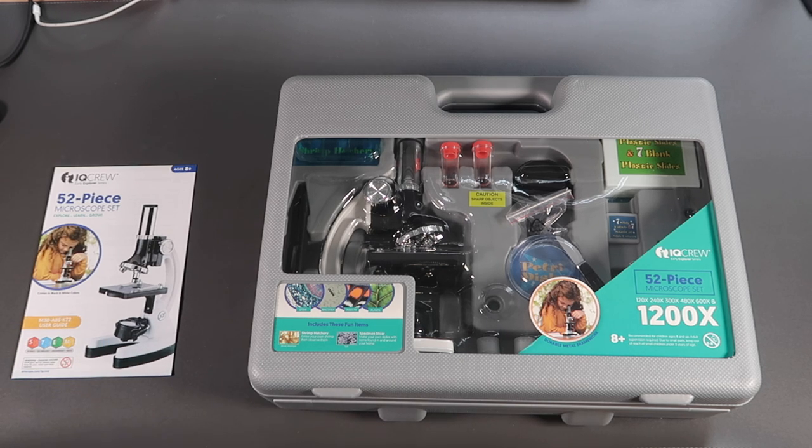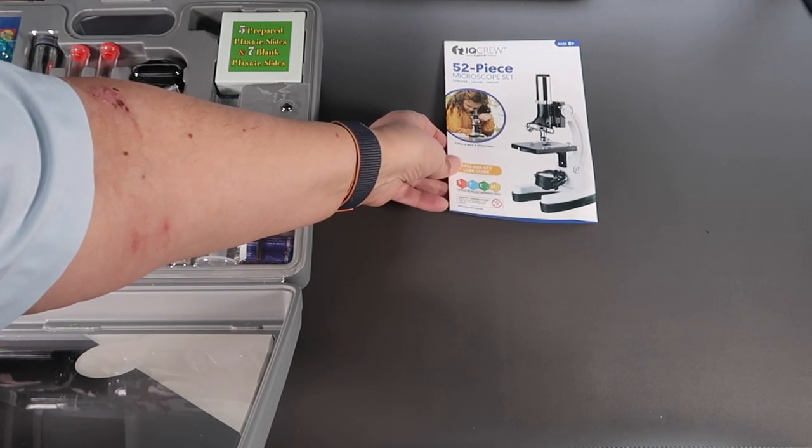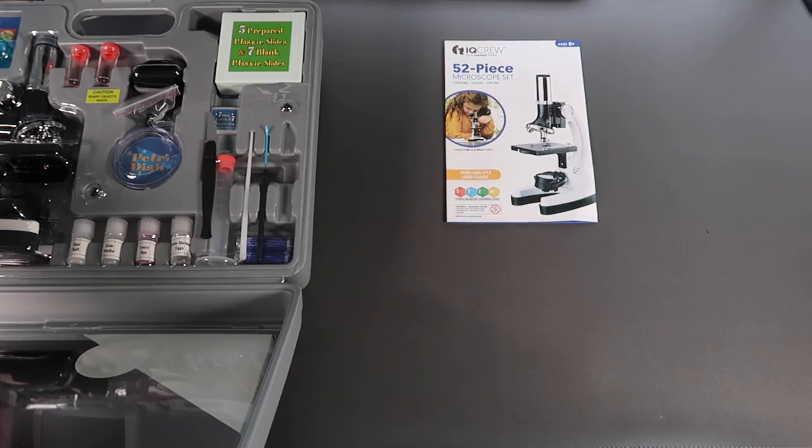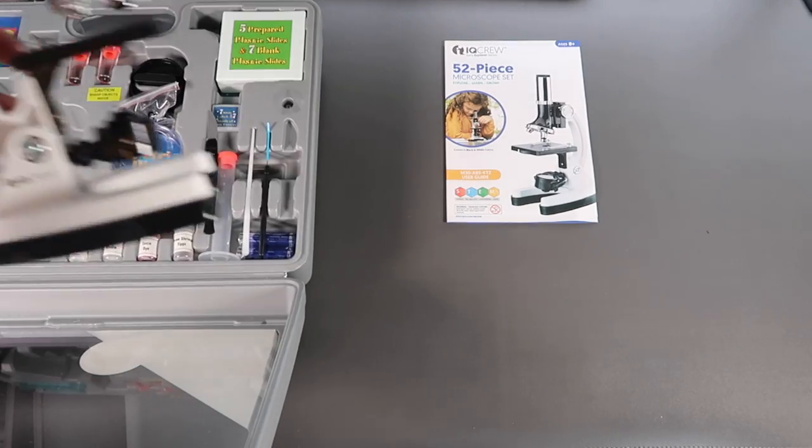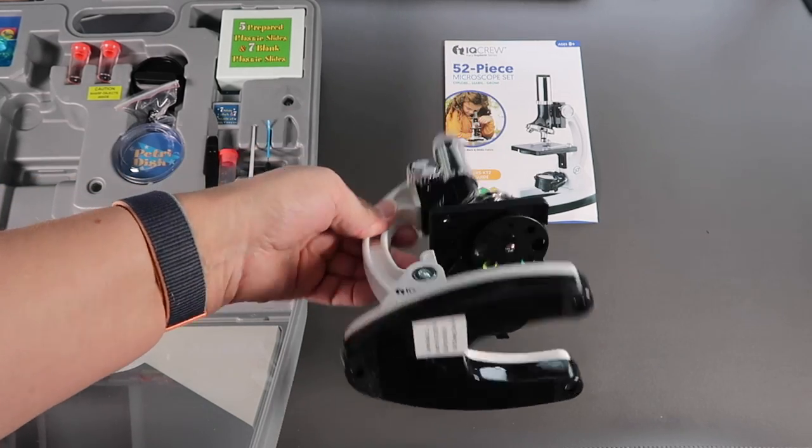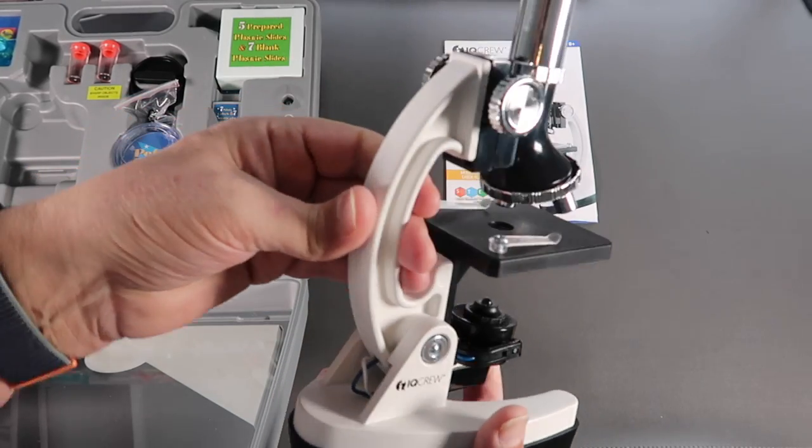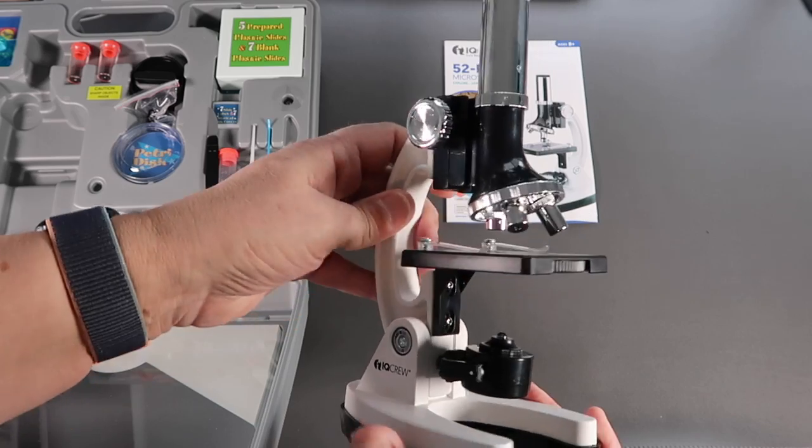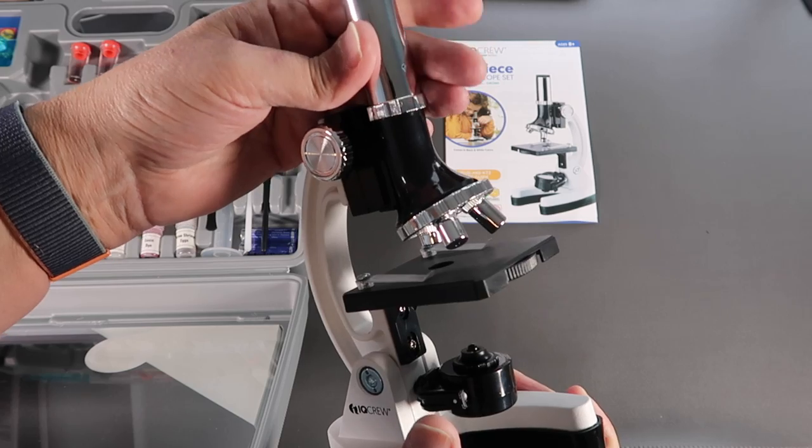Let's take a look at the components individually. The microscope itself. It's a little smaller than I thought. I'm not entirely sure what it's made of. I don't think it's metal. I think it's a hard plastic, but it's pretty solid, pretty durable. I don't think this is going to break.